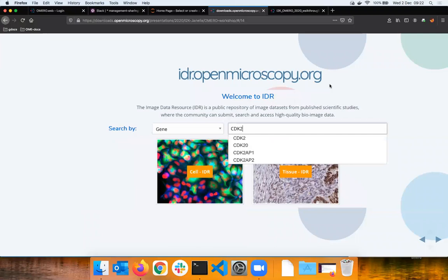Now, this is a little bit of a different topic. The IDR stands for Image Data Resource. This is a service which the OME team runs for the scientists of the world. Its purpose is to store, serve as a reference base and a reanalysis service for the scientists in the imaging world. The images there are being submitted to the OME team, or better said, the IDR team, which is a sub-part of the OME team, and it functions as a publisher.